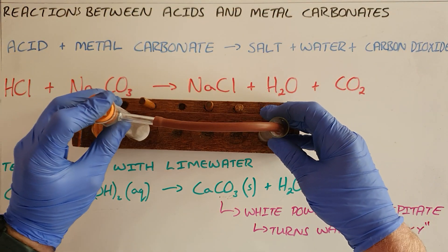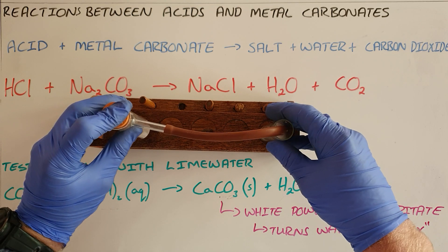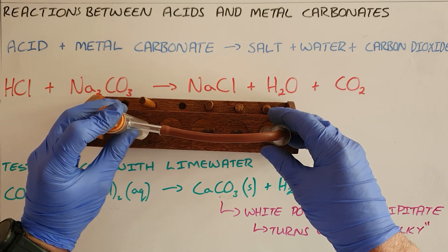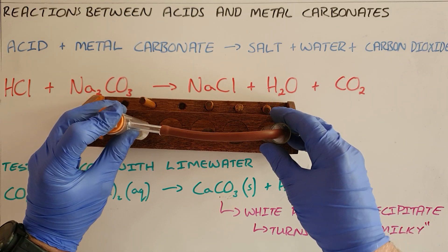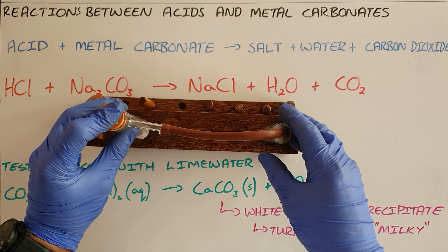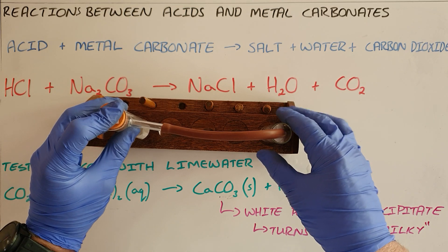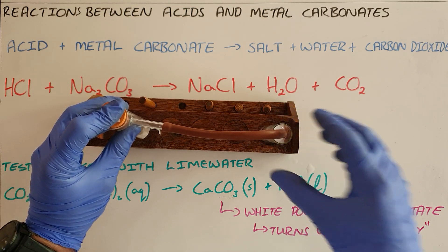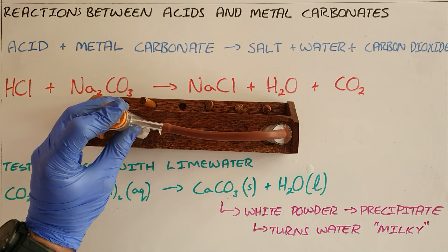The lime water has turned milky, which means that this reaction between hydrochloric acid and sodium carbonate has produced sodium chloride, water and carbon dioxide.